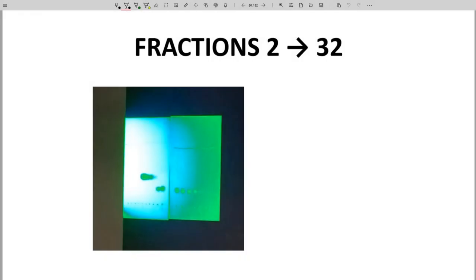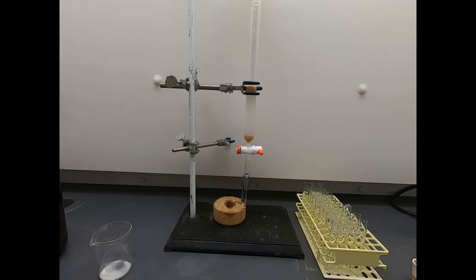Without going back to the video of the column, I went ahead and took another TLC plate. The second plate has 22, 24, 26, 28, 30, and I think that's 32. It looks like the compound is done by fraction 32. You can see the trend clearly here. The less polar compound comes off first, and it's followed by the more polar compound. Each one of the fractions that shows a spot contains that material. So those early fractions contain the less polar compound and the later fractions collectively contain the more polar compound.